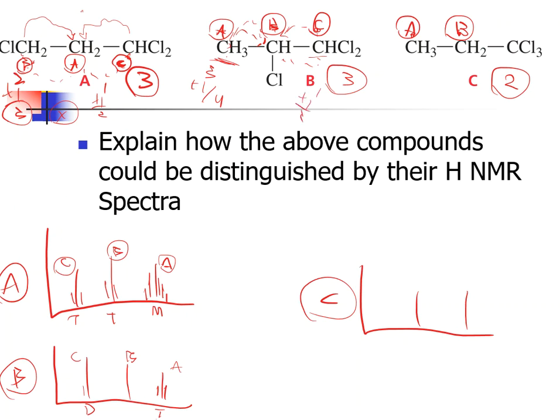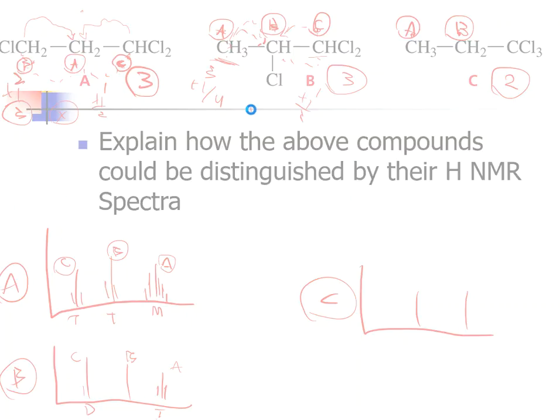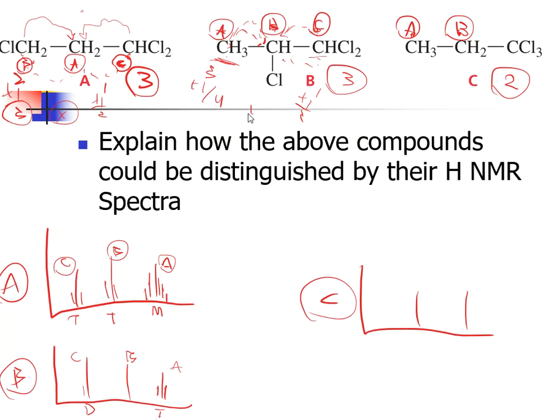And then because I've got 2 neighbors here, they amplify each other's antics. And what it will amplify is a 4 times 2, which is 8. So 1, 2, 3, 4, 5, 6, 7, and 8. So this is a multiplet here. So just like in A, we can use this to determine the difference again with all three signals.